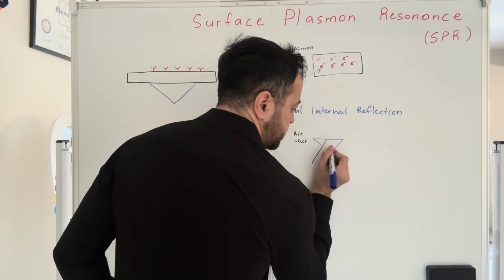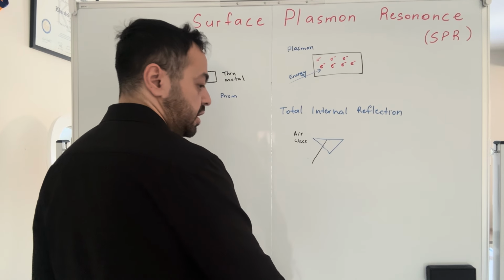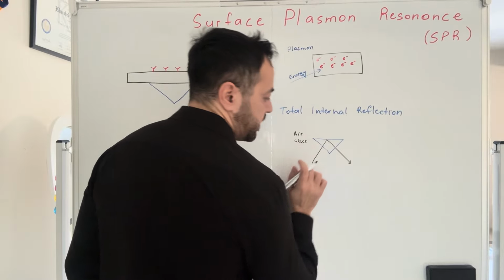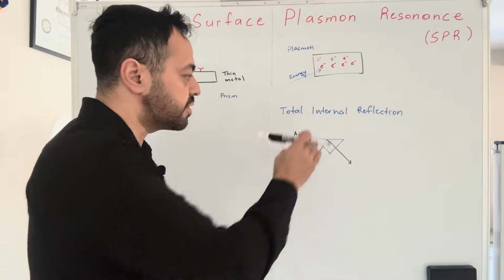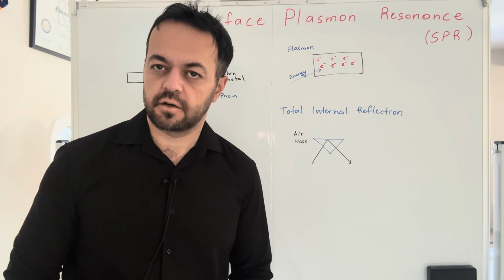So it's a normal behavior. You apply a laser or any light, it hits the surface, and then it completely reflects back. So this is basically total internal reflection. There should be two media here. In our case, this is the glass medium, and then on top, that's air.